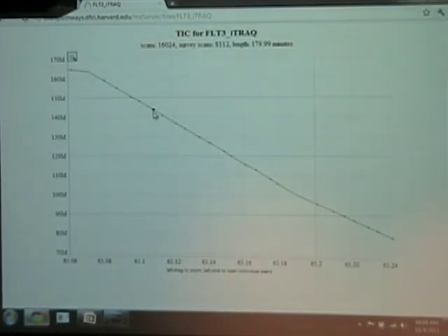So in the long run, you shouldn't need the entire raw file. The next step here is, right now you can pull spectra or XICs or various analyses of the data. We want to make more and more of the computation happen at the server. So higher level algorithms, dot product, searches of similar spectra, you should be able to tell the server to do things on your behalf. So the challenge is how to do that securely and not crash the machine. But the short answer is no, you can't download the raw file.